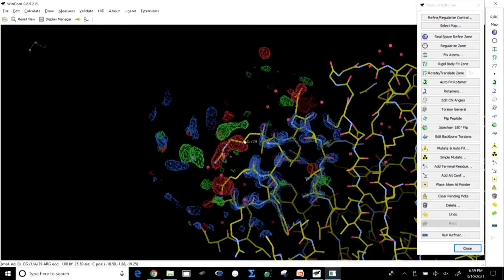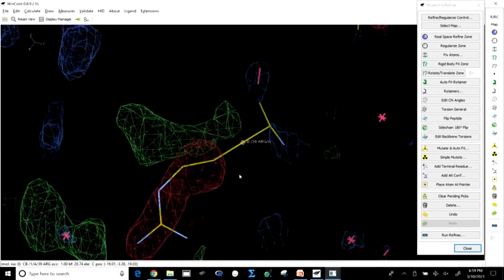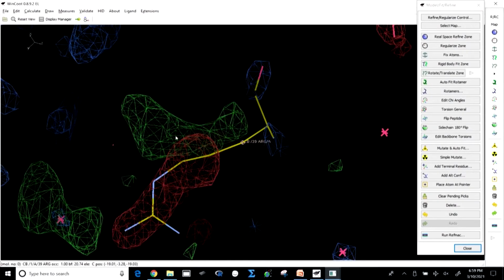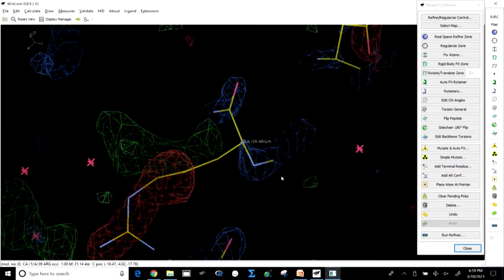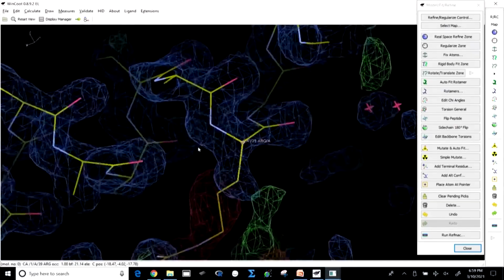When you should not, like here, you should not model it here, but you modeled it here, you get red. Like in the traffic light, you should not go, but you break the rule, now you get fined. So, here also the fine means you actually have a wrong structure.